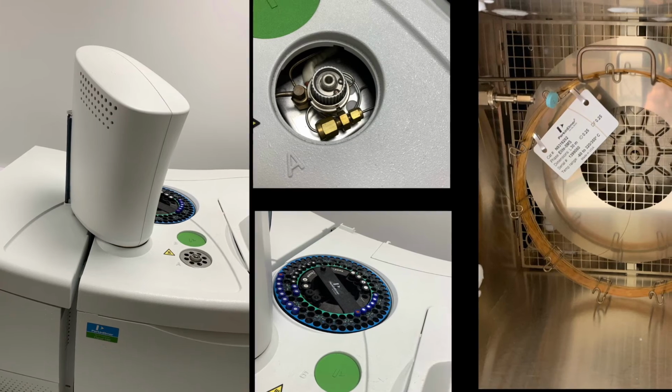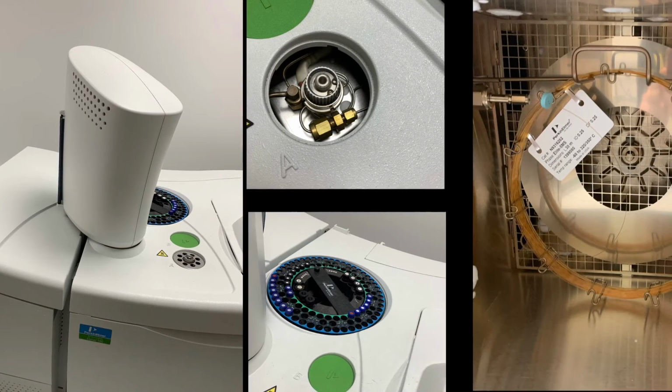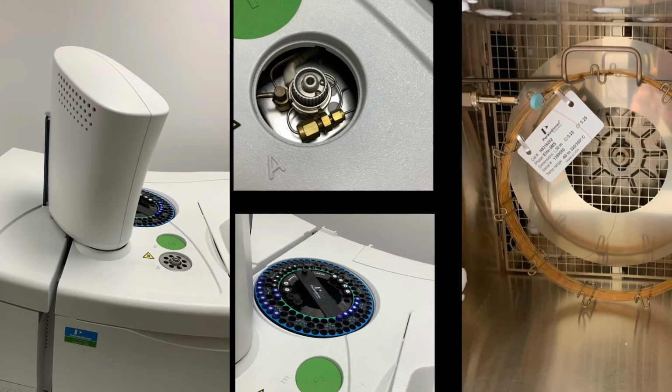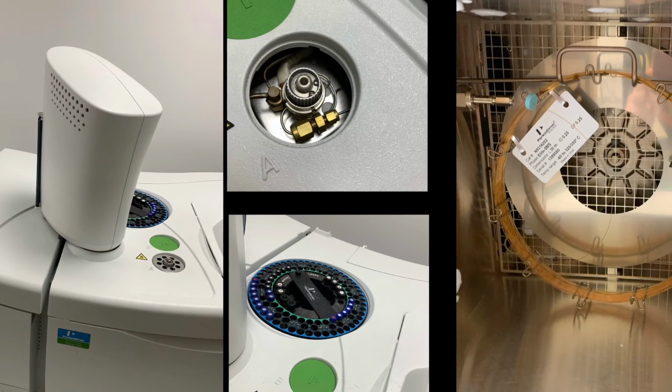I'm going to start with the autosampler, which is responsible for storing each of the individual chemicals. They also reproducibly deliver the sample to an analytical instrument in which the sample is going to get analysed. In this case, it's the GCMS.